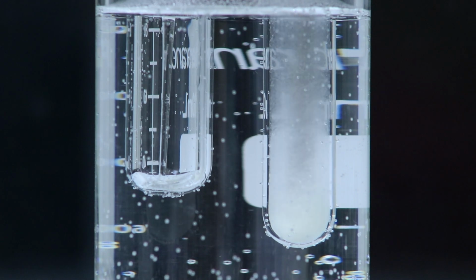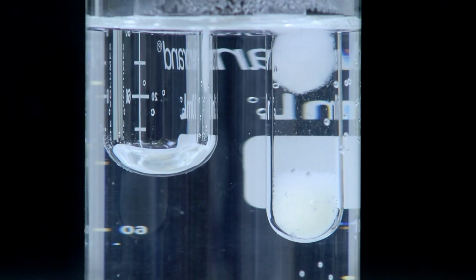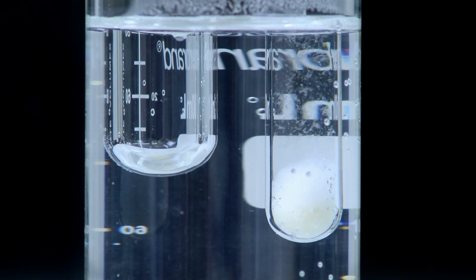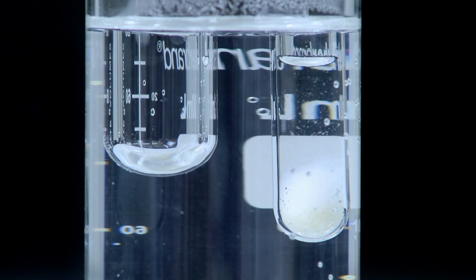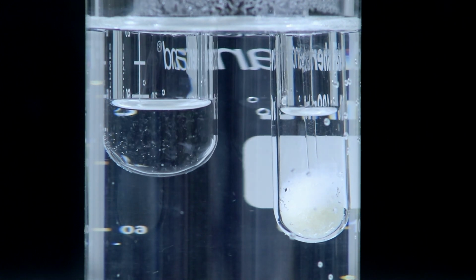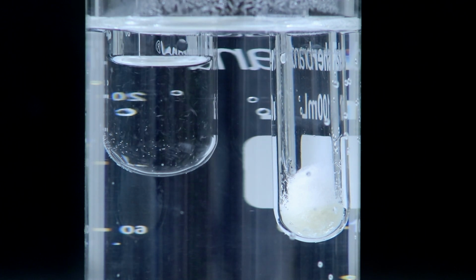So from here, I'll be doing the hot filtration technique. I'll add a piece of cotton on top of the remaining solid and allow the solution to settle a little bit. And once it has, I'll start pipetting the solution through the cotton and transferring it to a new test tube, which should keep the acid contamination behind, hopefully leaving just the product in the ligroin solution.